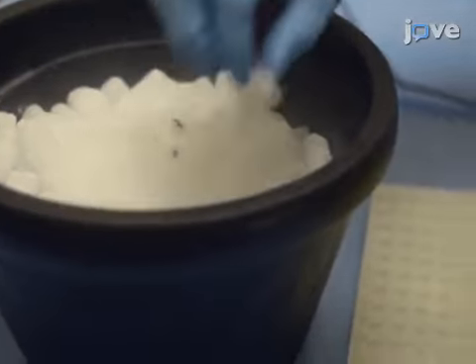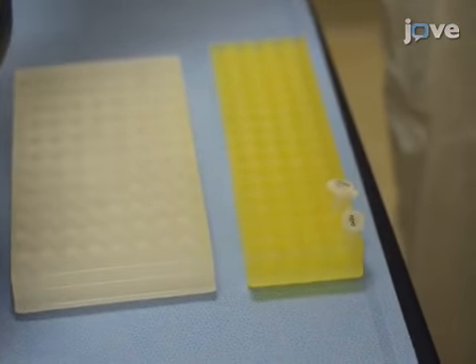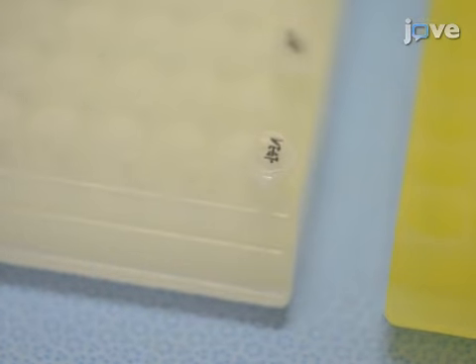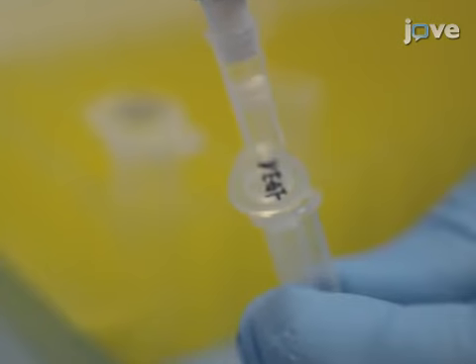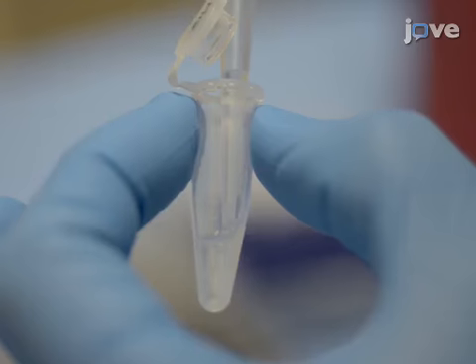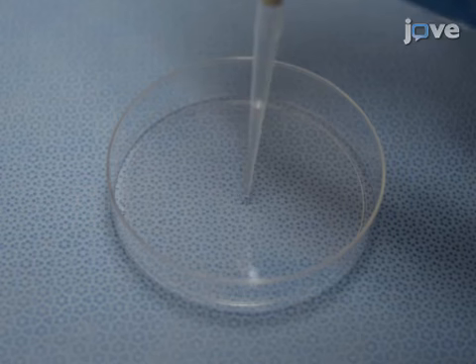To prepare fibrin gels that contain both VEGF and bFGF, begin by warming minus 80 degrees Celsius stocks of fibrinogen and thrombin to room temperature. When the stocks are fully thawed, add thrombin, calcium chloride, VEGF, and bFGF to the fibrinogen solution in a 1.5 milliliter tube, and then mix the solution by pipetting.